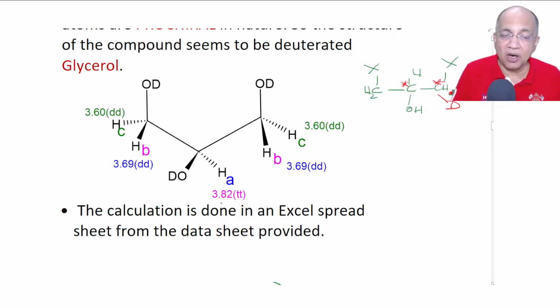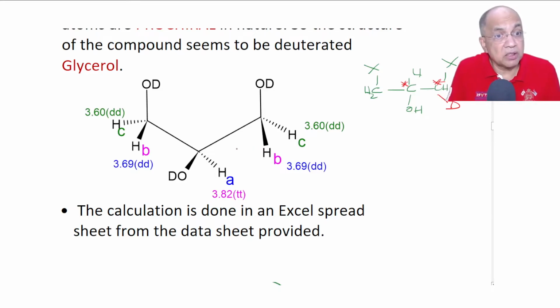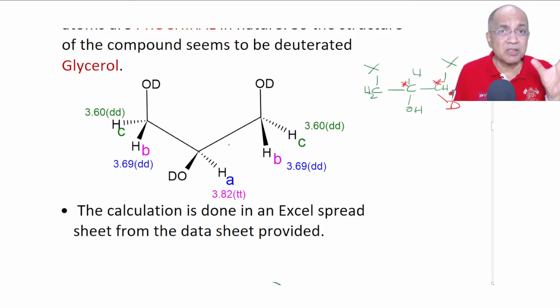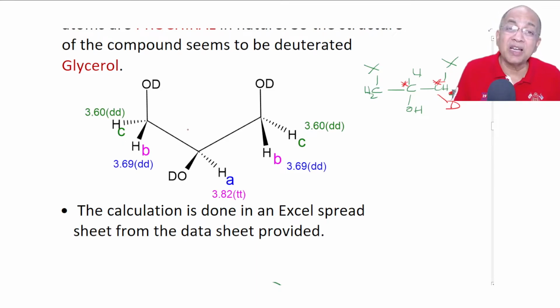And this HA at the downfield position is a TT, because for HA all are J3, 1 2 3, 1 2 3, and coincidentally, accidentally, all these values are not the same. Had it been the same, in many cases, due to rapid rotation, J3 values are the same. So had it been the same, then 2 plus 2, 4, plus 1, 5, it would have been a quintet.